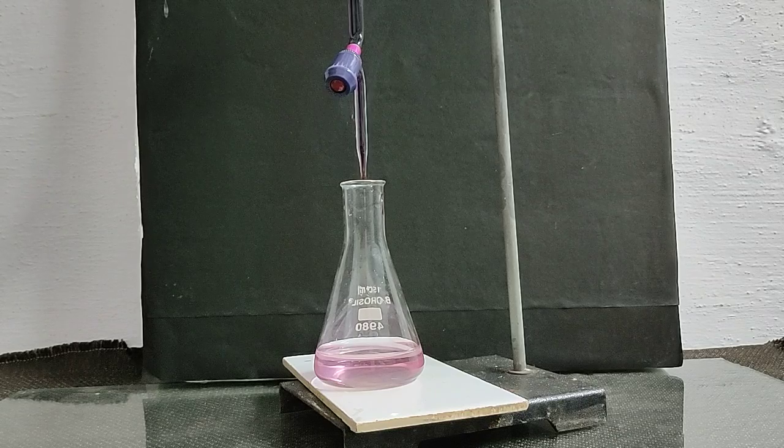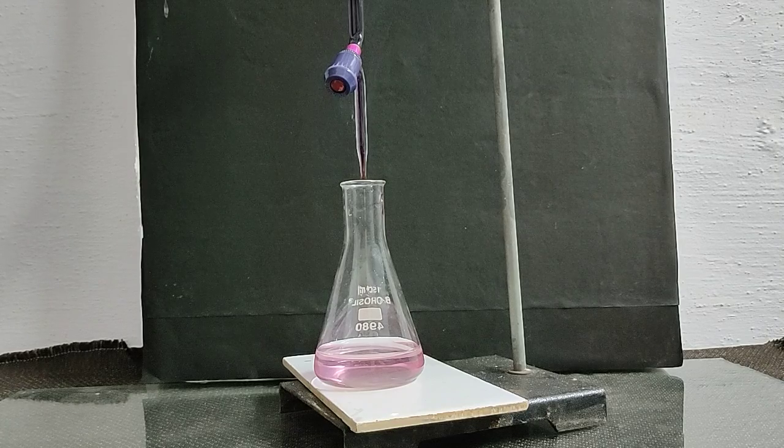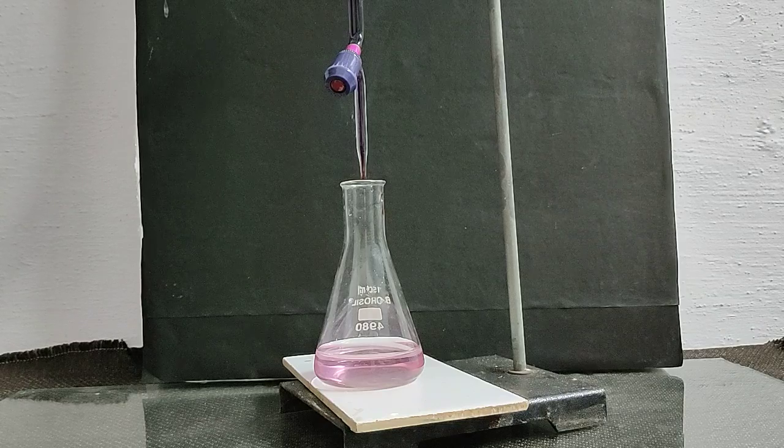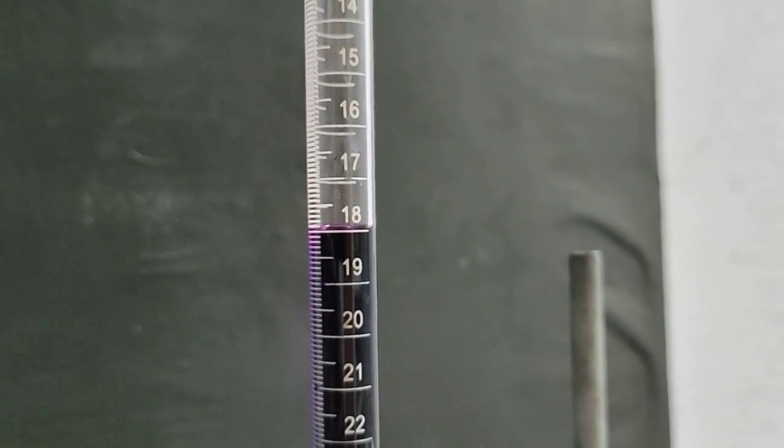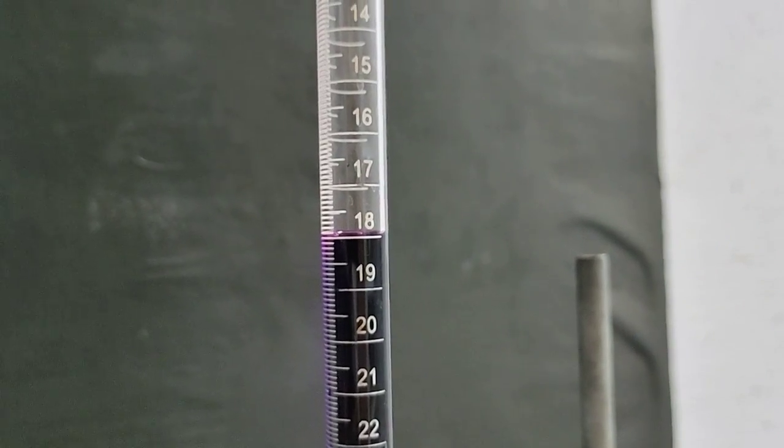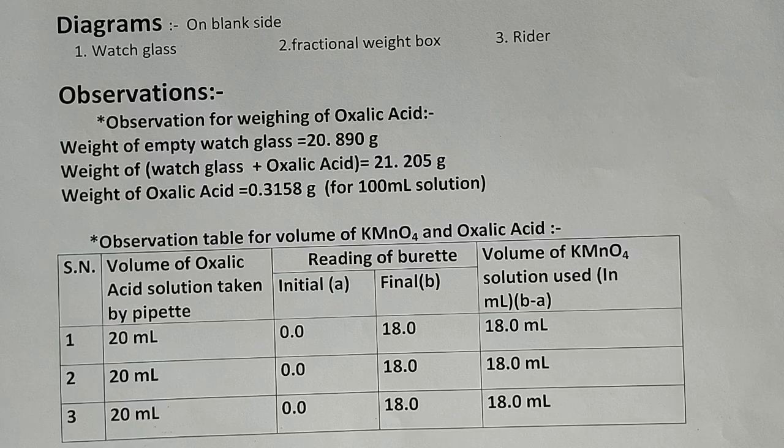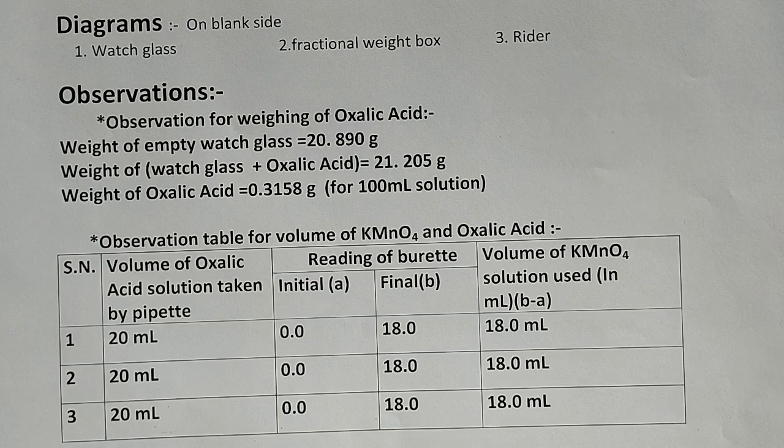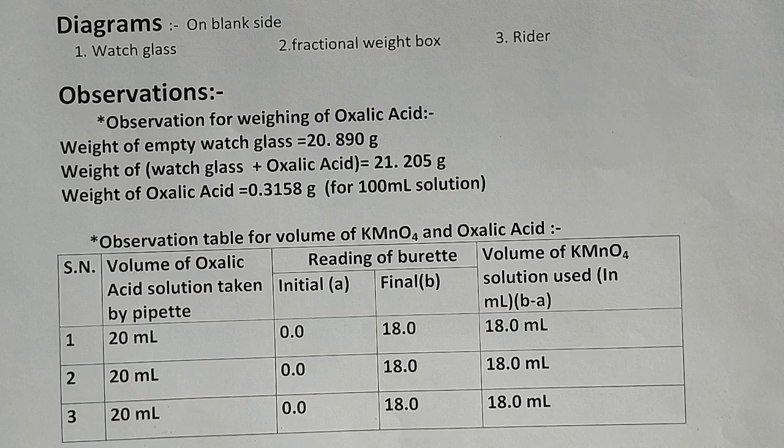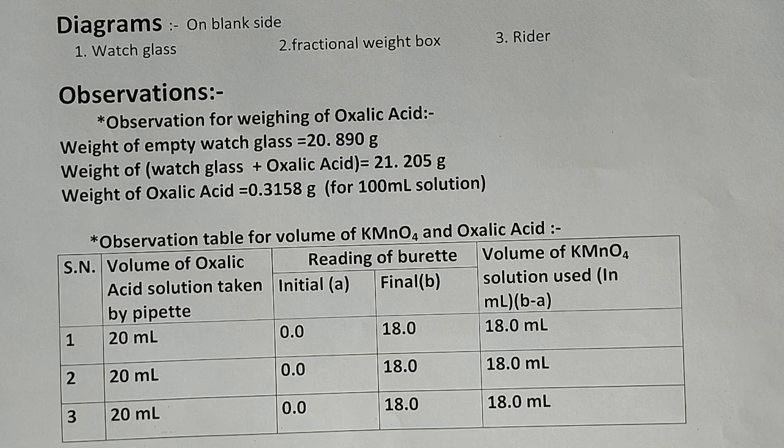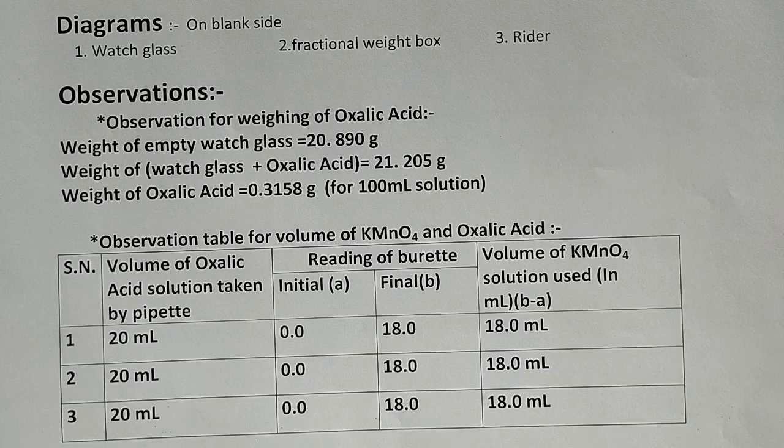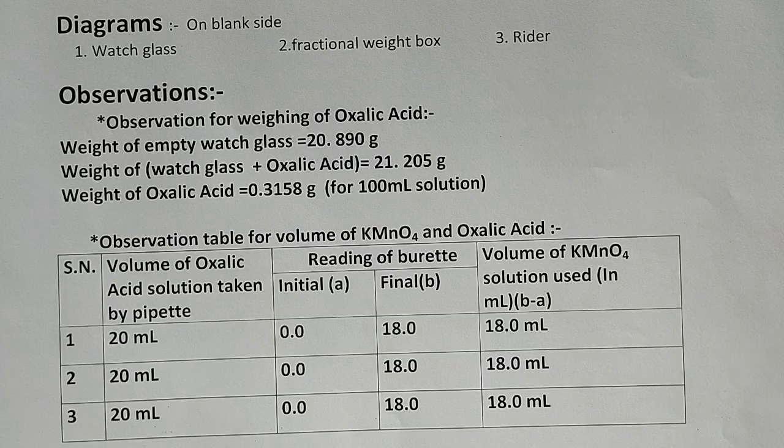Ultimately we get light pink color. End point is 18 ml. Volume of KMnO4 solution used against 20 ml oxalic acid is 18.0 ml.